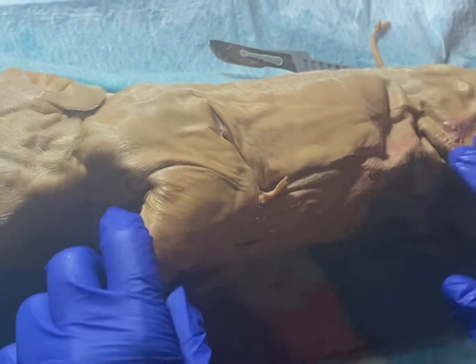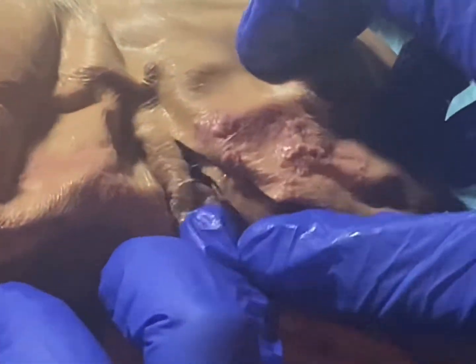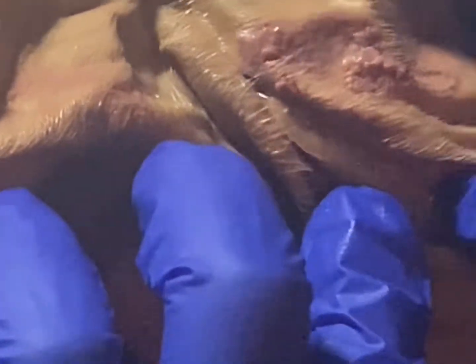The next, we were asked to identify the humerus, which is the big bone in here, the proximal bone in the upper extremity. We have the femur, which is located right here. I couldn't get the muscle off the bone, so I can feel the bone right here, but we just can't visualize the bone at this point.